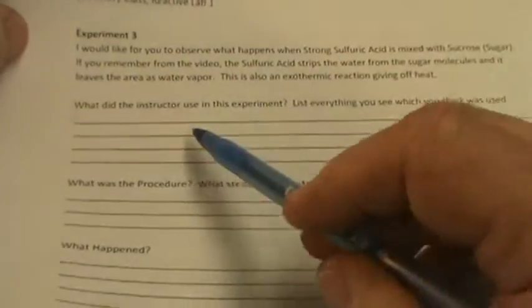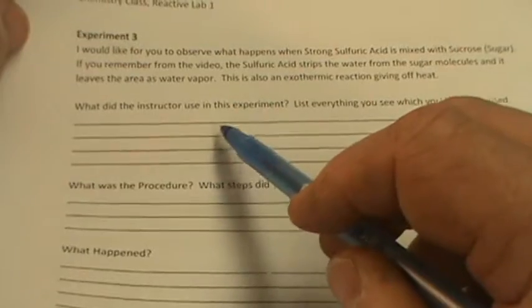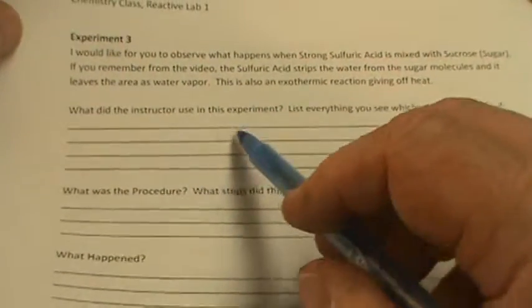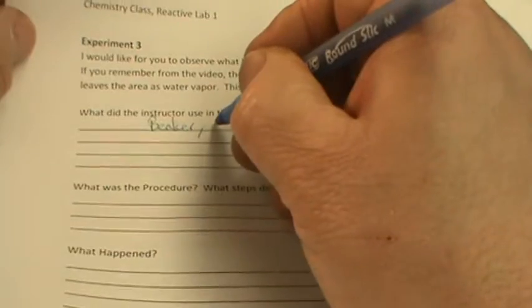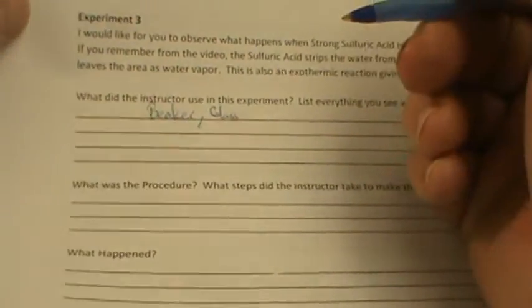So then on the last page, this was for the sulfuric acid and sugar video, and the video, as I said, is already posted, so here's the run up to it. What did the instructor use? Well, we used a beaker, a glass pan. I guess I got some acid on my pen there.